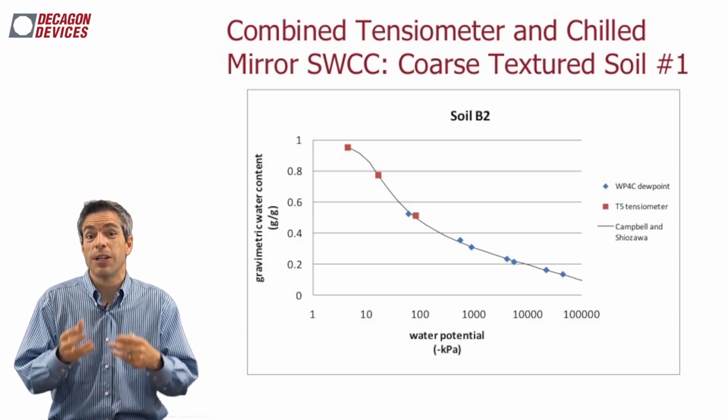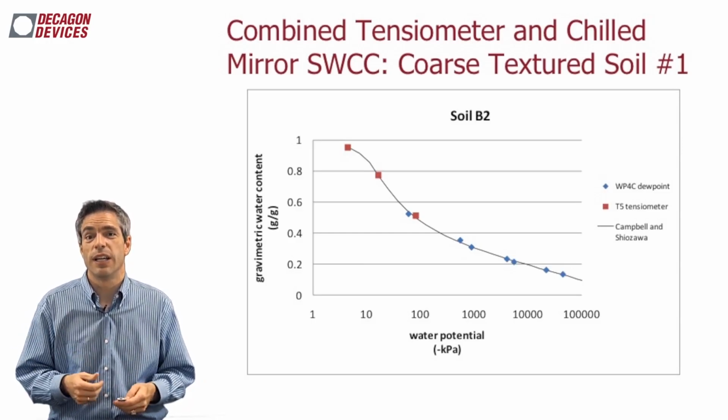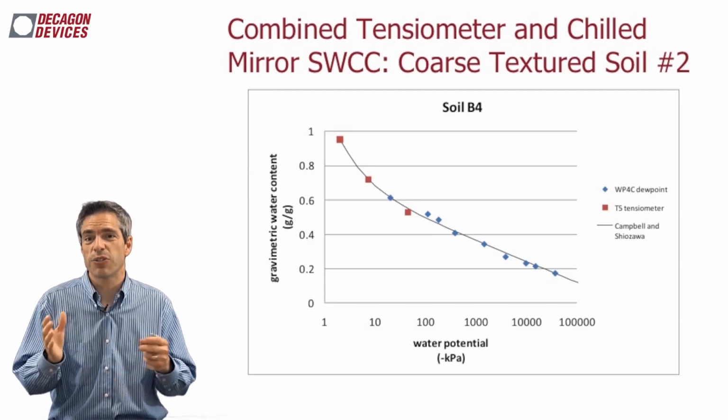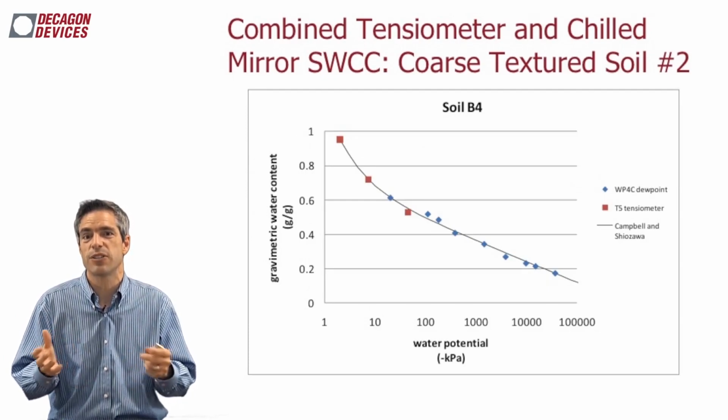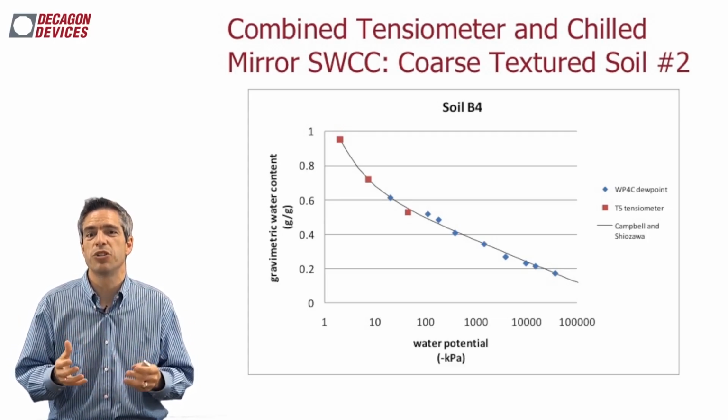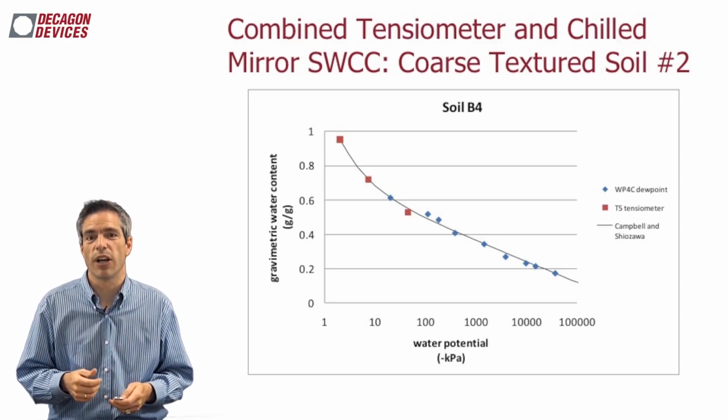Did it happen every time? Well, that's really what we wanted to know in some additional tests. Here's another volcanic soil. Those are fairly similar soils. We weren't surprised to see we got a consistent relationship. And we were really happy that we could fit it with an equation to give us this relationship in our SWCC.